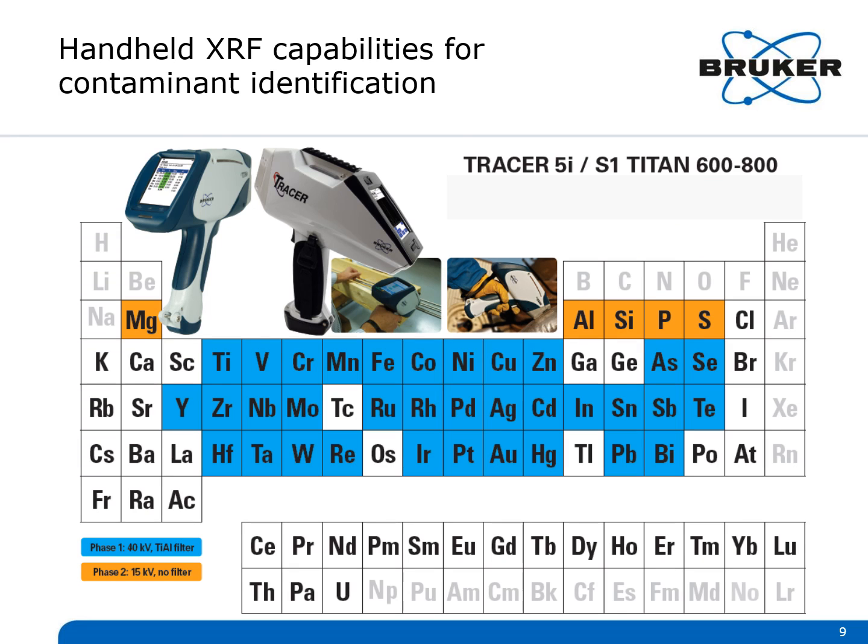So what exactly is the XRF measuring to give you results in the form of an alloy ID? Handheld XRFs detect elements as light as magnesium on the periodic table to as heavy as uranium. The most common elements of interest in alloy identification are the light ones as seen in the gold boxes and the medium and heavy elements as seen in the blue boxes.